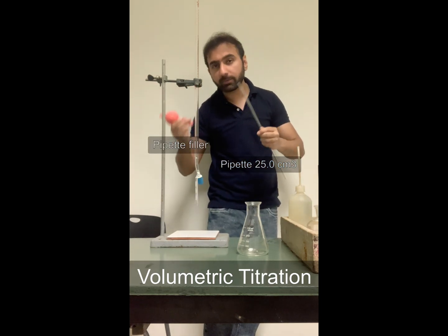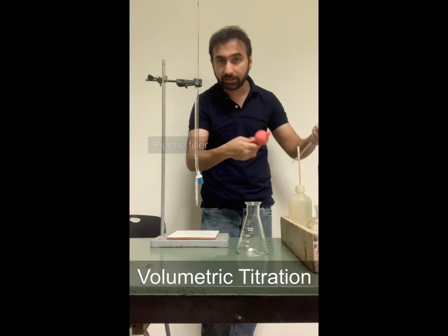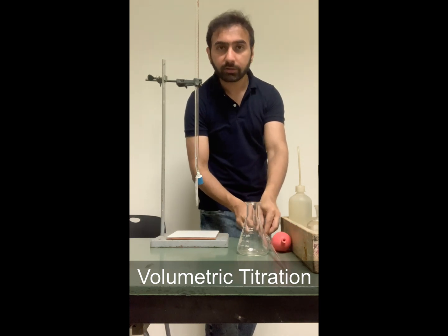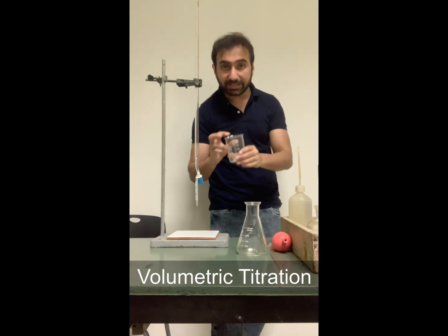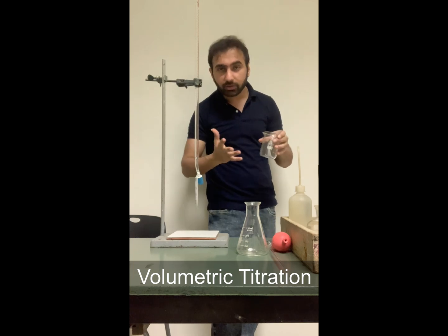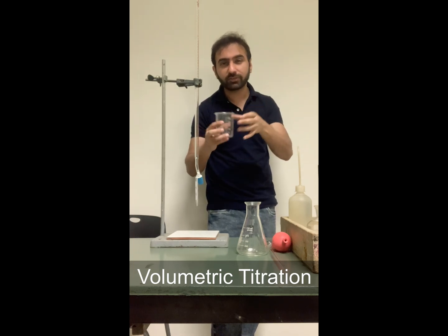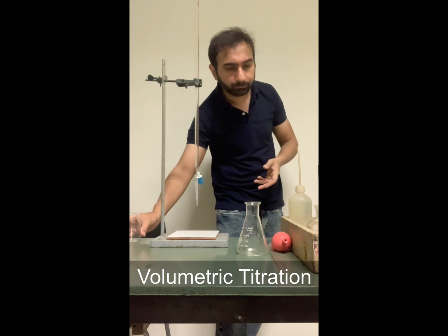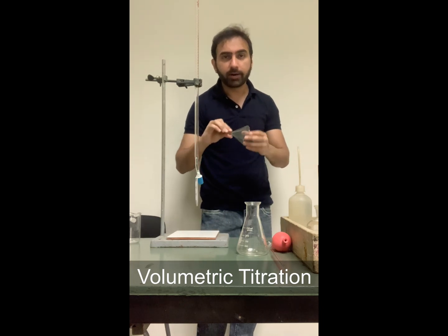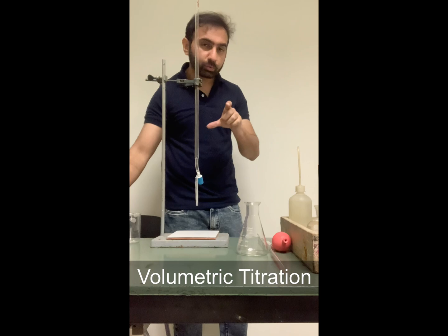We have a safety bulb also known as the pipette filler, so I'll be explaining how to use that also. These are two important apparatus that we will be using. Then I've got a beaker with me, a funnel — we will be using it also.